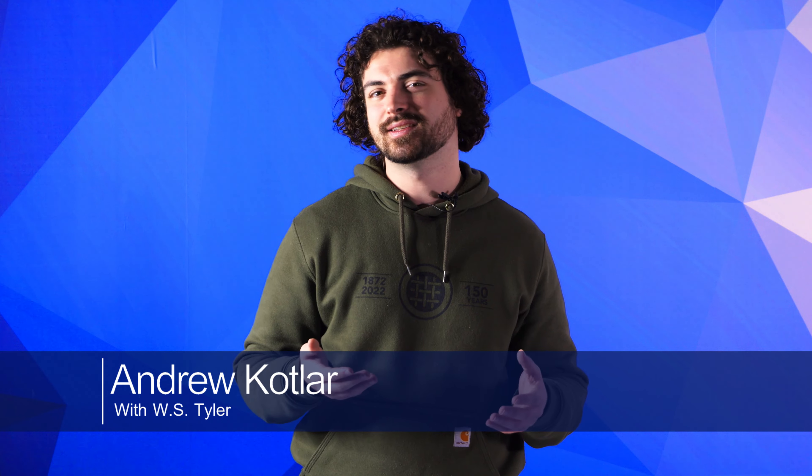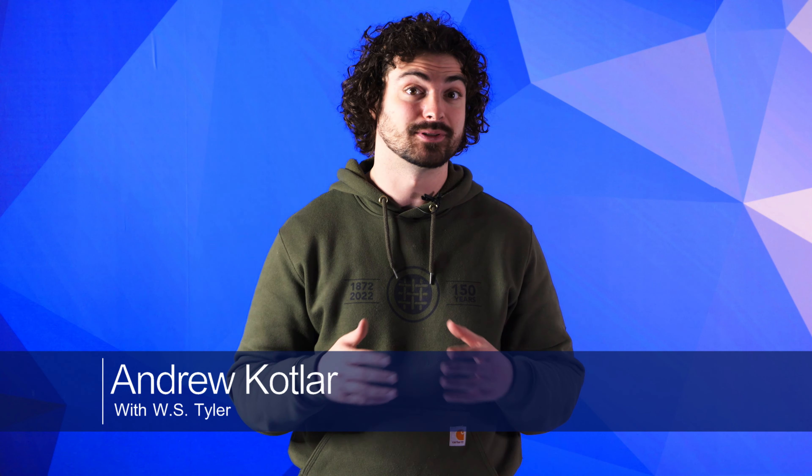My name's Andrew Kotlar, and particle analysis is a very important factor in almost every industry, from pharmaceuticals to agriculture to gas and oil and many more. And one of the most common tools used in particle analysis is the test sieve.